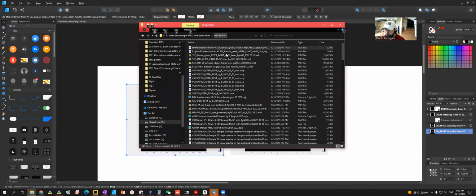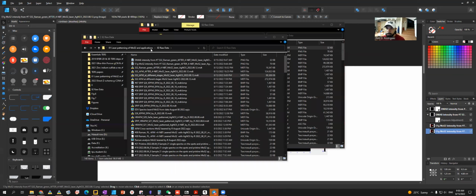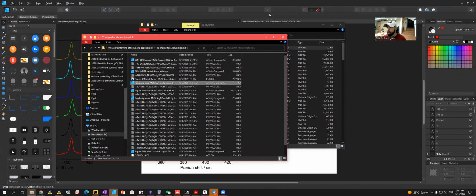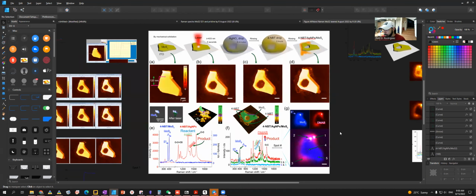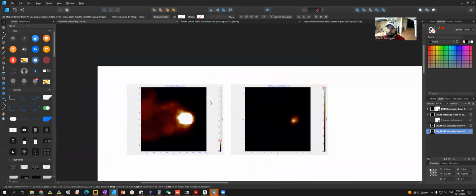So I'm going to come here. I already know that there are some figures. Let me see, this is the same. So I will go here, go to the figures. Same EDX, no, I don't expect this one. So I will open the original that I already have, and what I'm going to do is reuse the scale bars I already put there. So that's a good thing.